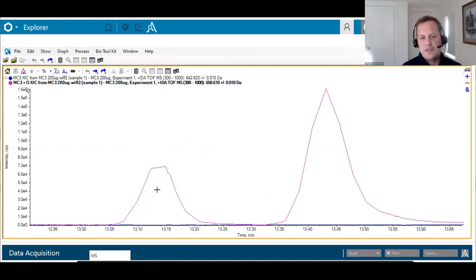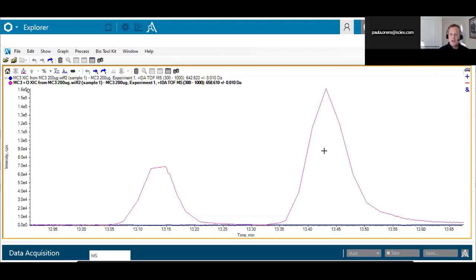This is oxidation at C6, and then I can develop an MRM based assay now that these have been characterized. And look for some of those diagnostic fragment ions in particular, again to track and monitor some of these oxidative impurities that may be more problematic than others. And with that, I will pause.